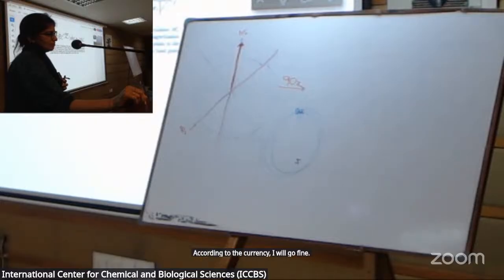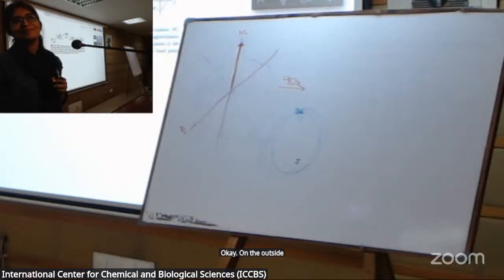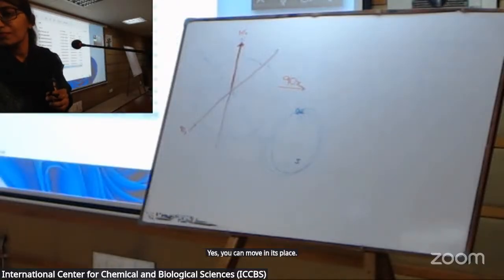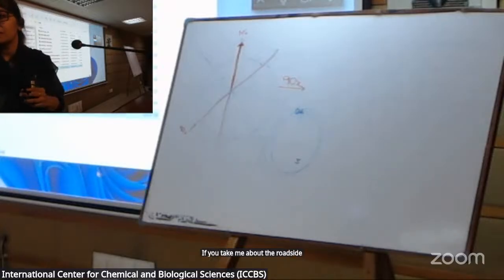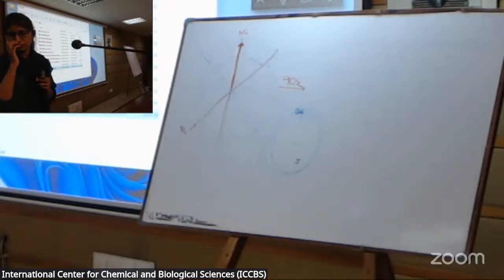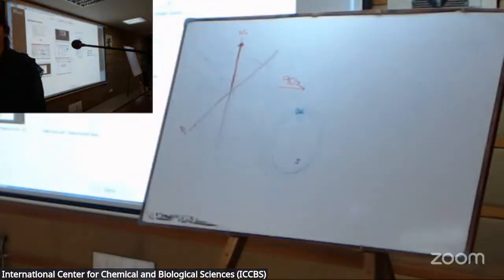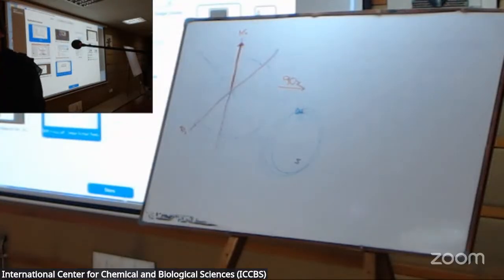If your pulse takes a long time, it shows a prolonged time of pulse, so it does not stop here because you have a long time. If the pulse is short, it can move it. If you make the pulse for a long time, it can remain. The time will give us the 90 or 180, just by changing the time of the pulse.